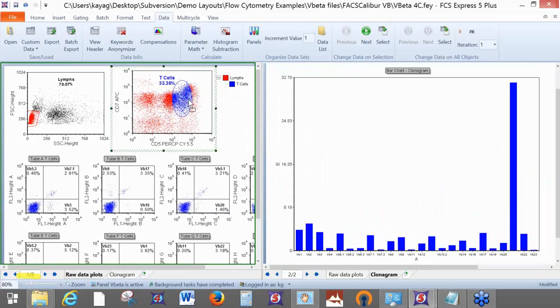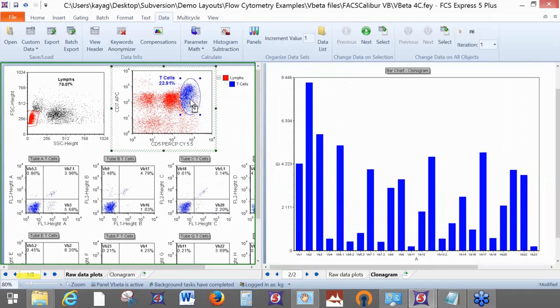So the key point here is this is a very interesting, complicated layout that might have taken a little bit of effort to set up initially. And using panels, you can reuse this layout over and over again. So all of the elements, including the bar plot and any other sophisticated reporting graphs you'd want to put in, will be included in the panel.